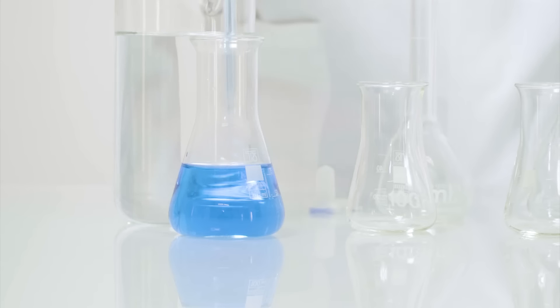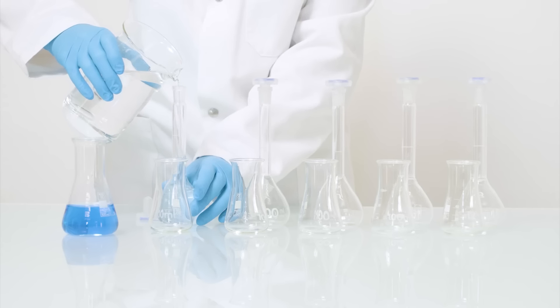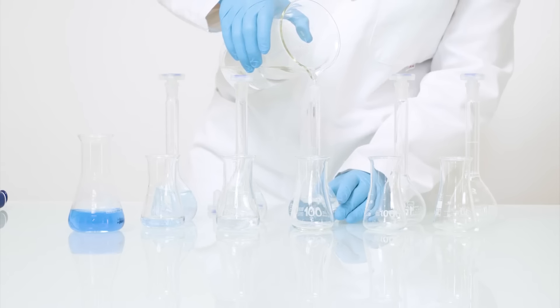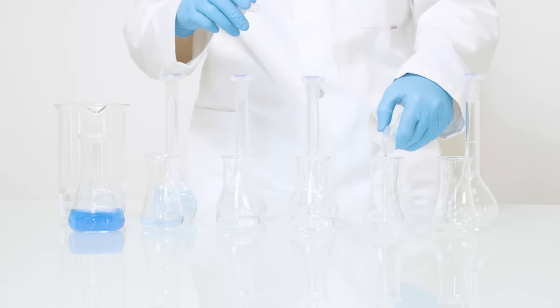Trace metal analysis by spectroscopy techniques requires preparation of reference standards with exact concentrations for each of the metals potentially present. This is a tedious and repetitive task.